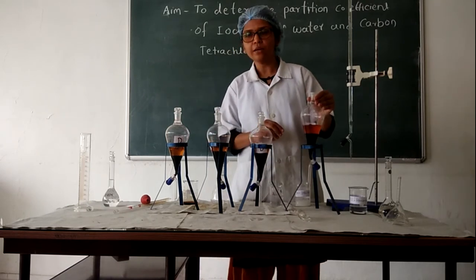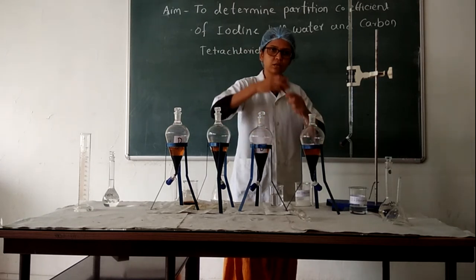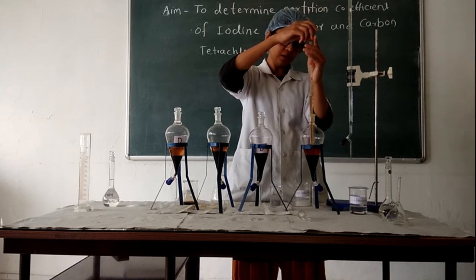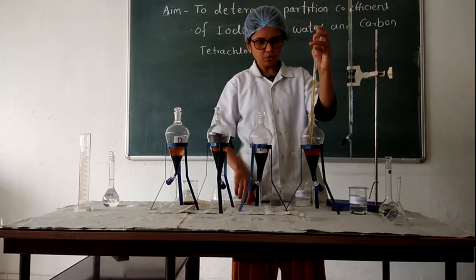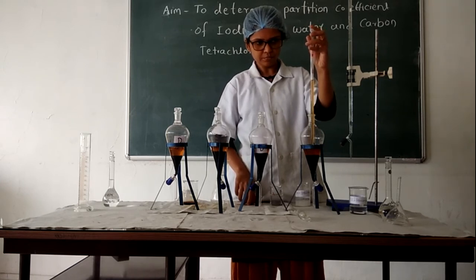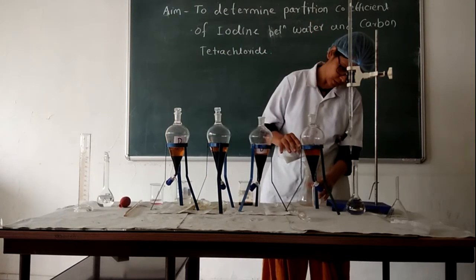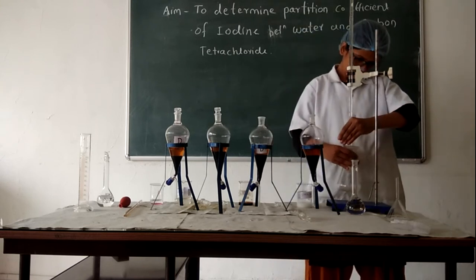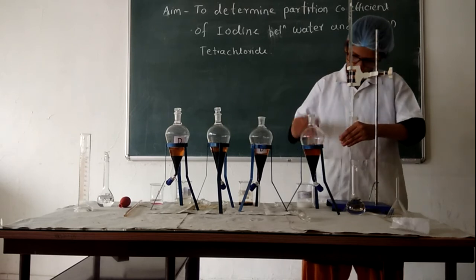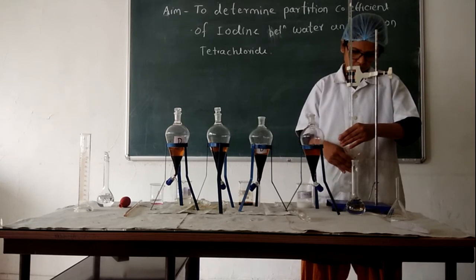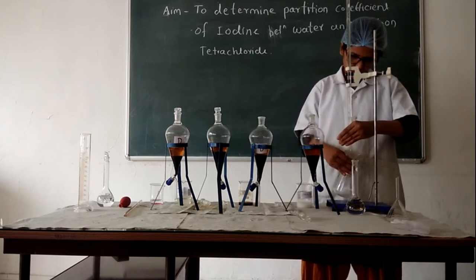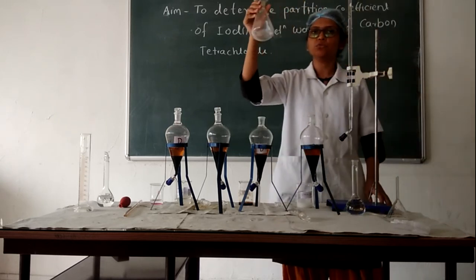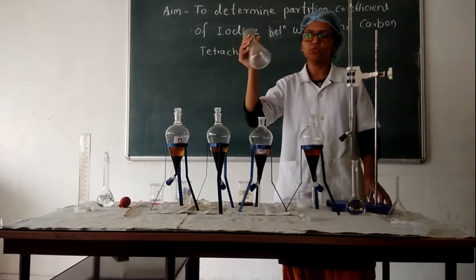Remove the aqueous layer with the help of a pipette and titrate it against 0.01 normal sodium thiosulphate. Add starch indicator into the aqueous layer and titrate against 0.01 normal sodium thiosulphate. The colored solution is then converted into a colorless form, indicating the endpoint.